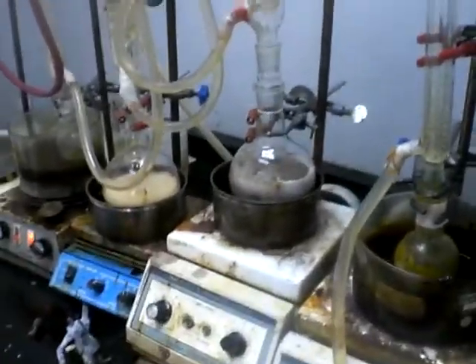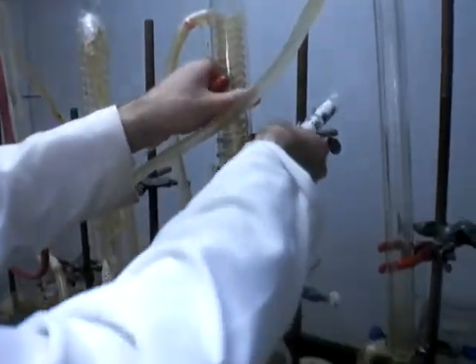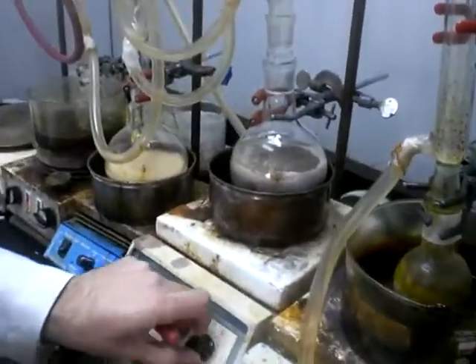Hello, we want to talk today about the TLC in detail. Here, the aim is to see if we have the product occurring after a certain reaction. You can see the reflux apparatus here, and we have the solution underneath.